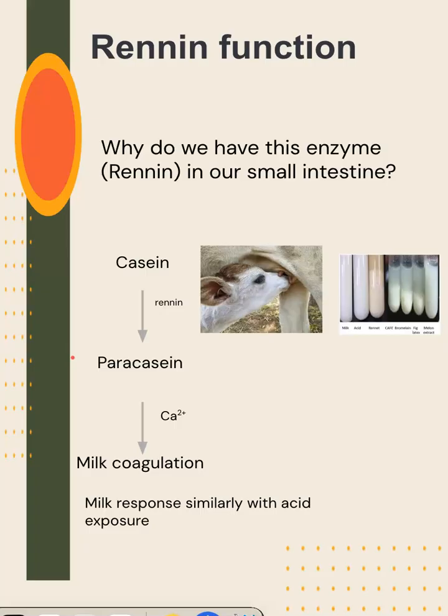However, milk is very runny, right? Milk is a liquid, it's super runny. So you can imagine that if the infant was to drink that milk without the milk being able to solidify, it would basically just run through the infant. There isn't enough time for the infant's body to really absorb the material in that milk efficiently.